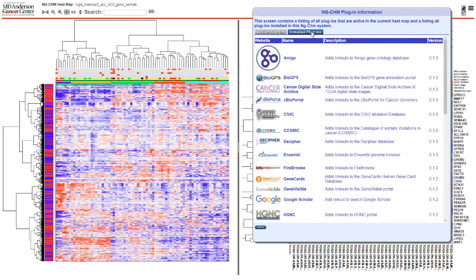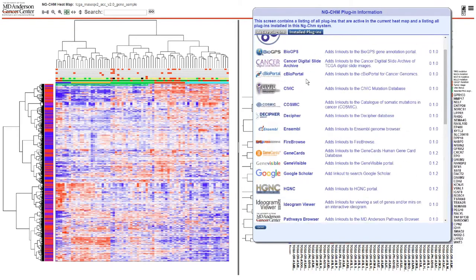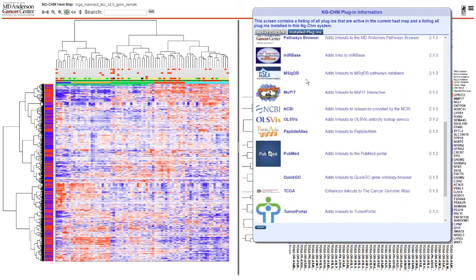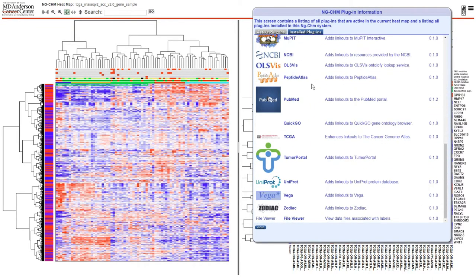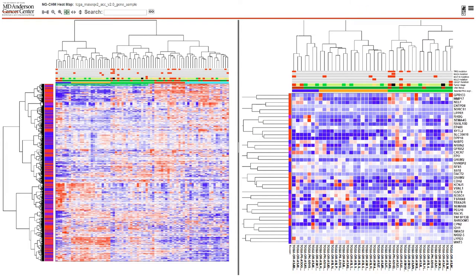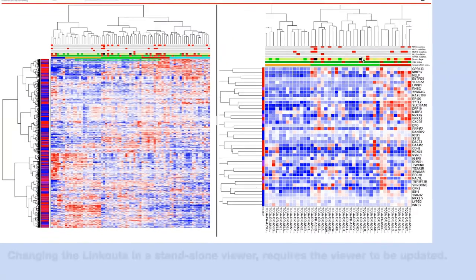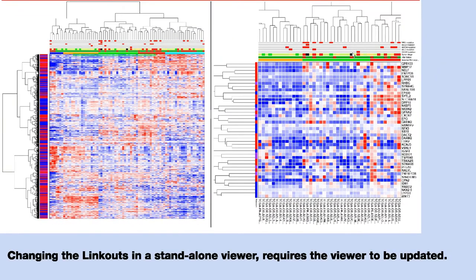Link out plugins can easily be added to or removed from a server-based viewer, and they can also be modified. Such changes may be reflected in the link outs incorporated into the label menus. Changing the link out plugins in a standalone viewer requires the viewer to be updated.